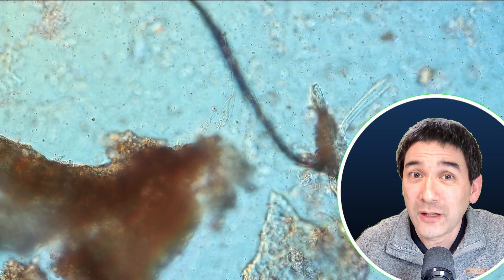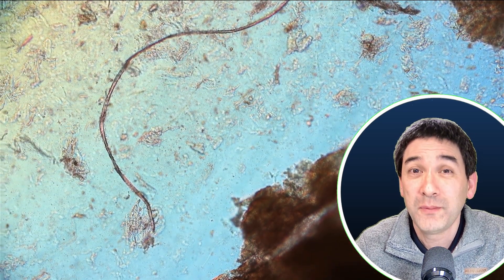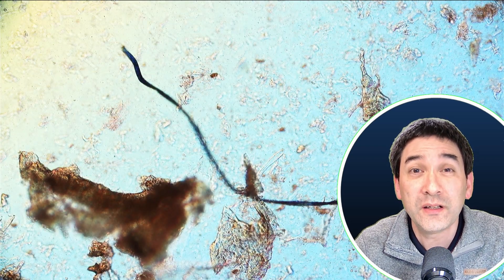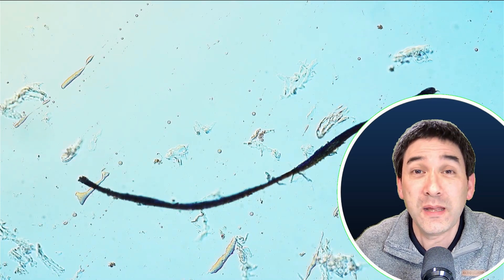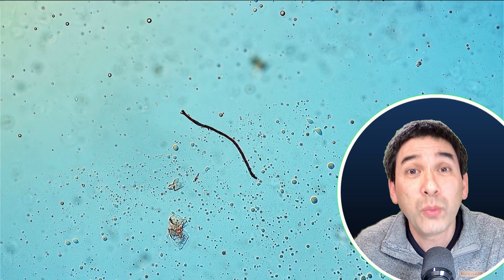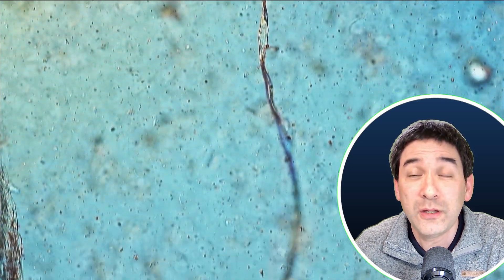But there were also things in there that I did not like so much. These long structures that you see here are fibers, and these are unfortunately contaminants. These fibers in some cases can be synthetic and you find them also in clothing. Synthetic fibers in clothing are washed out during the washing process and then end up in the water, in streams, and also in nature — scientists have even found them in rain droplets. So unfortunately they are quite common in nature these days. They are a source of microplastics and they are taken up by tiny animals. Now we can see that they also end up in fields — soybean fields maybe — and somehow found their way into this vegan meat. To my surprise, I found quite a few of those fibers in the specimen sample; on one microscope slide in a tiny piece of this vegan meat, I found maybe three to five of these fibers.